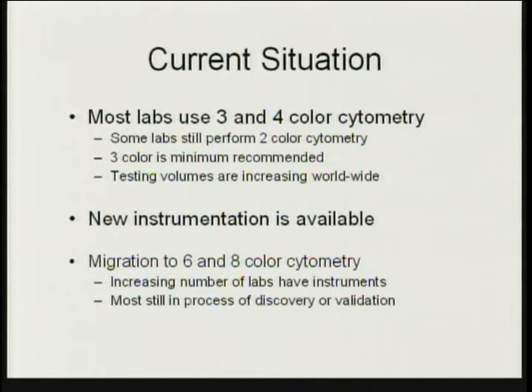So increasing numbers of labs, particularly in academic setting, have instruments like this, but they're having difficulty getting these instruments online and validated, such that they're still largely transferring their 4-color panels to 6 or 8-color instruments and then thinking in the future about trying to develop new assays. And so there's the need for assistance in terms of the discovery and validation of panels of reagents suitable for use in these contexts.